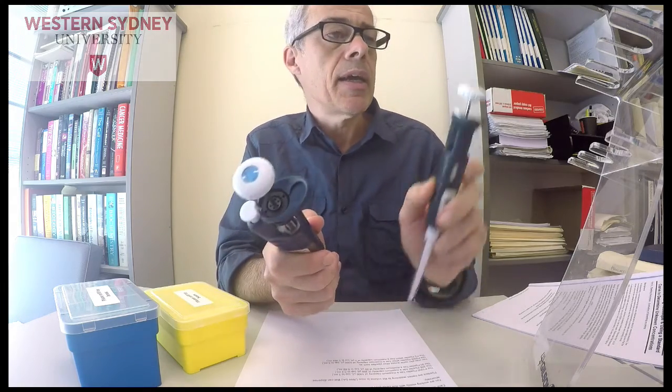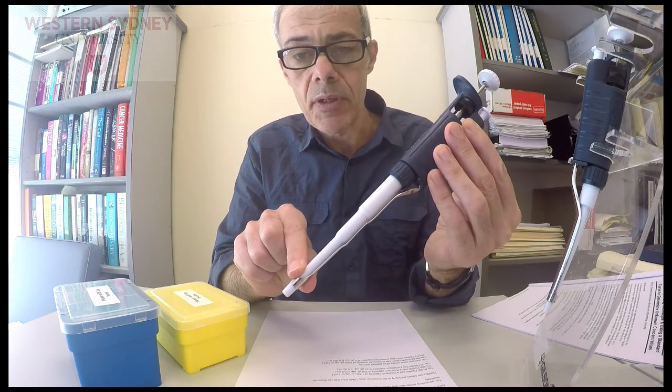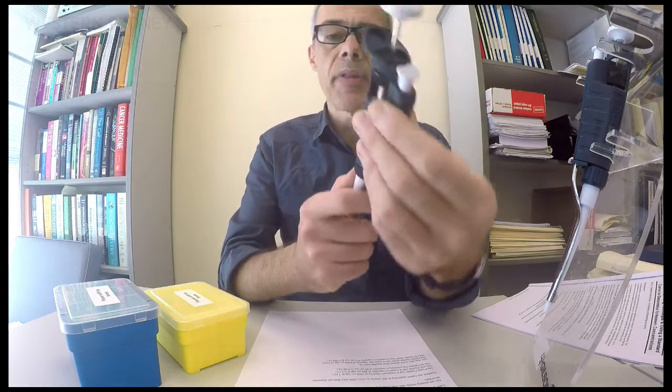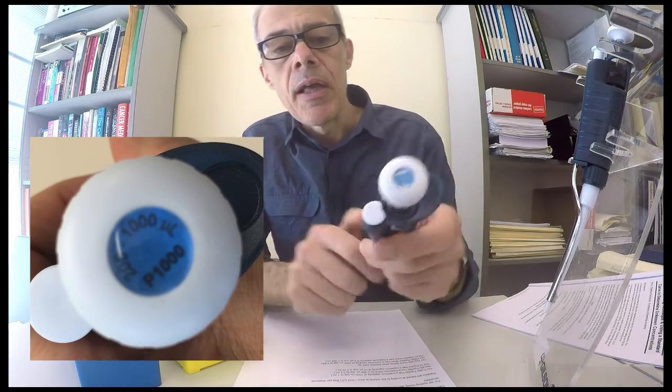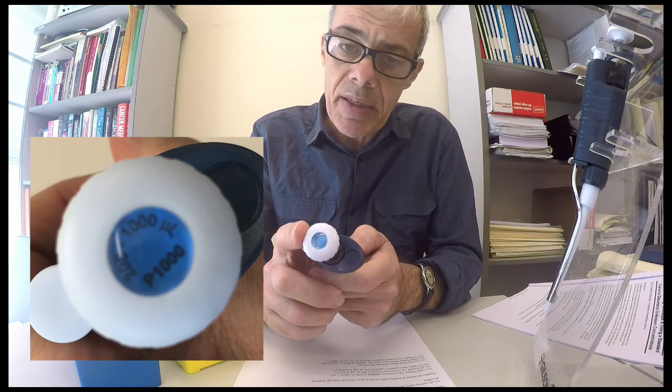Now if we look at one of these pipettes here, this is a P1000, a pipette 1000, and I call it a P1000 because on the little cap here it says P1000. That refers to the maximum volume that you can dispense with this pipette.